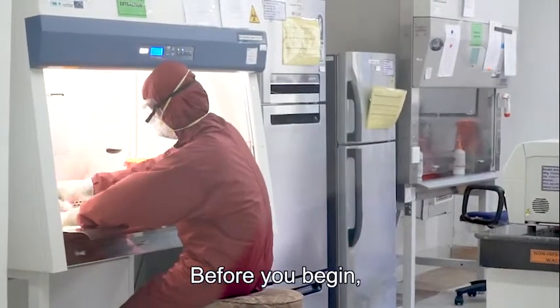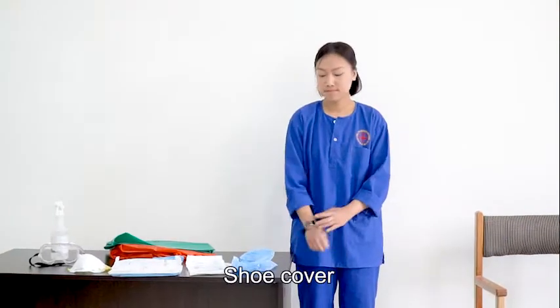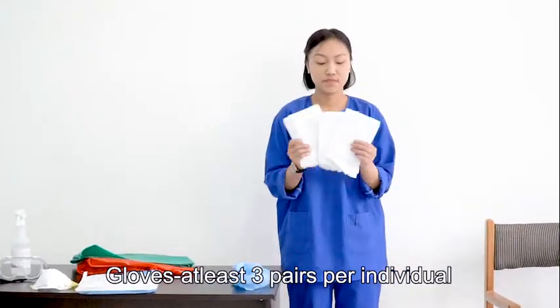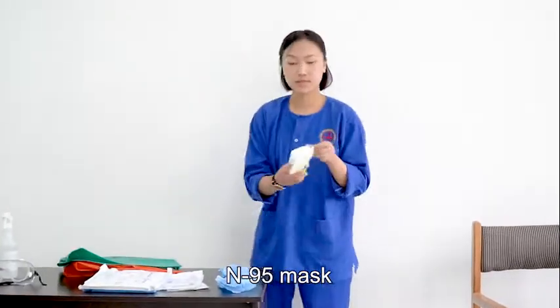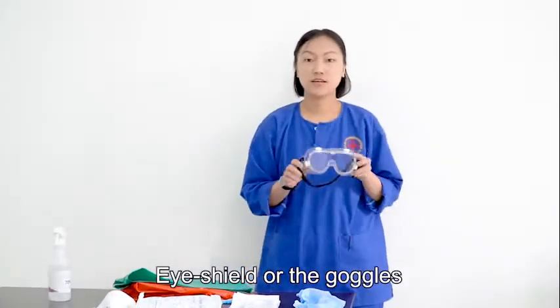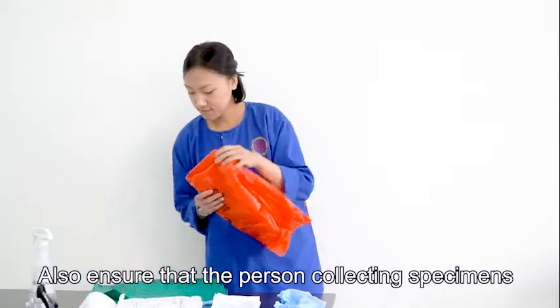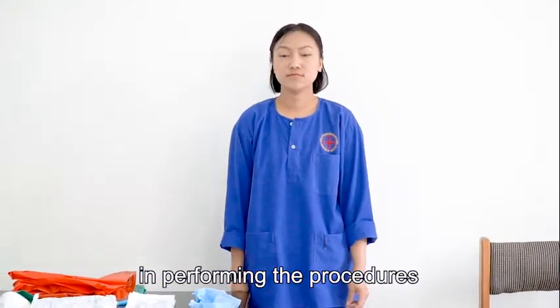Before you begin, please check that all required items are gathered. First, the shoe cover with waterproof boots, gloves, at least 3 pairs per individual, coverall, N95 mask, head cover, eye shield, alcohol-based hand rubs, and biohazard bags. Also ensure that the person collecting specimens is in good health and is competent in performing the procedure.